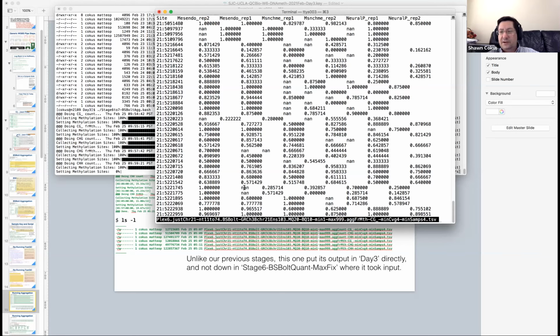And when we import this file, we'll turn these from the three-letter string NaN into real R NAs, so that all of R's missing data business works as expected. And you see some lines have two NaNs, but nobody has got more than that. And if you want a really hacky way, we can check that.